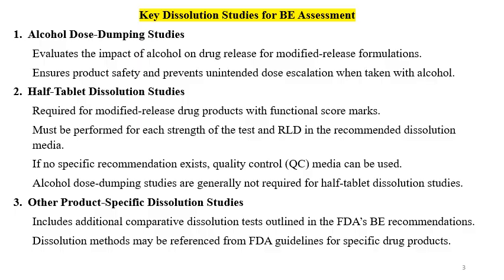Also, for MR products and IR products, depending on the formulation, the agency may ask you to perform half tablet dissolution studies in multimedia also. Alcohol dose dumping studies are generally not required for half tablet dissolution studies. If the formulation is coated and there is no score line, then half tablet dissolution studies will not come into the requirement.